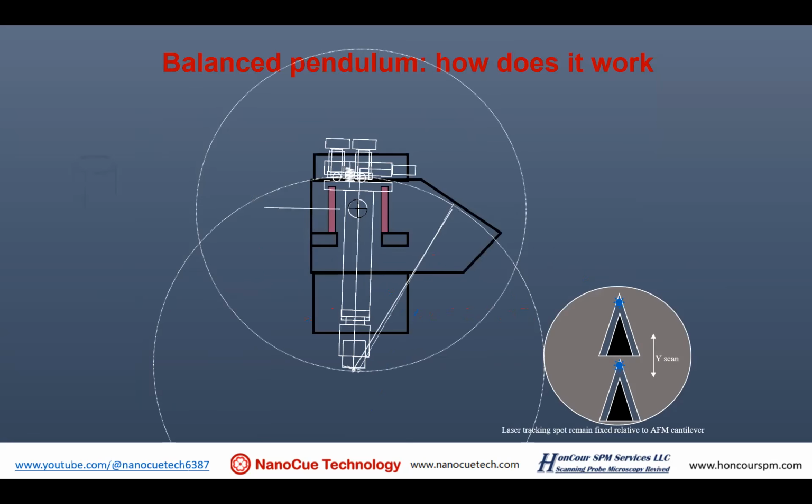This is the design of the scanner, as you can see. This scanner is a pendulum structure. Here, the two knobs on the top are for laser alignment. And here is how you scan.